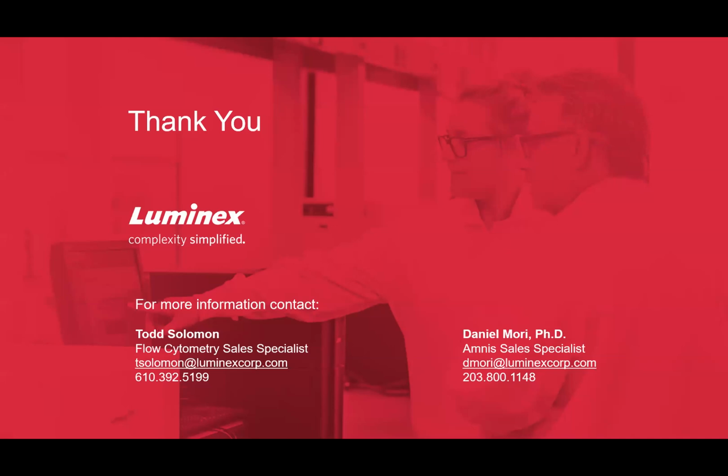And then on the Amnis side, there's a lot of QC calculations involved because we need to make sure our images are always in focus. So we're running speed beads alongside of the sample at all times to make sure that the core stream is in focus to the objectives. In addition to that, we also calibrate, if you have 3 objectives, the 20, the 40, and the 60x objectives. And then we also make sure that they're all aligned to the flow cell itself. So there's a series of about 40 tests that the Amnis actually goes through on the QC side.